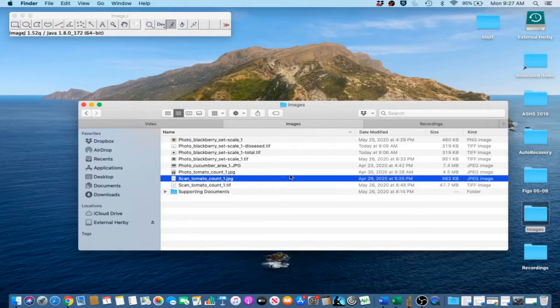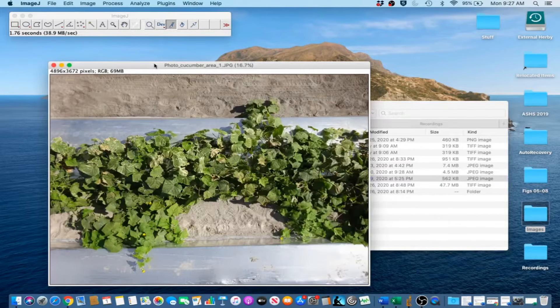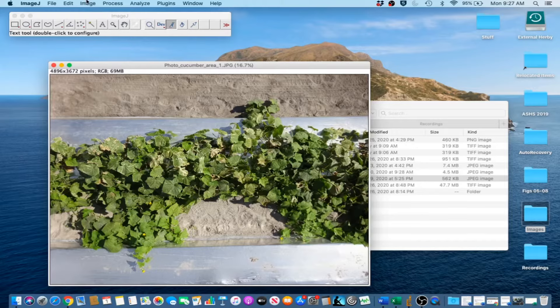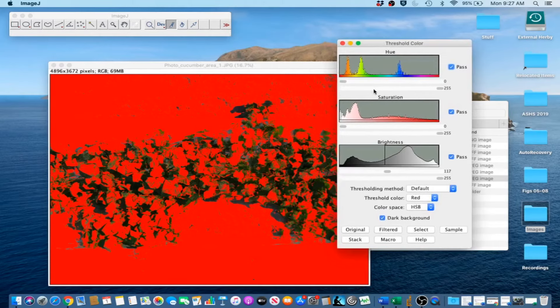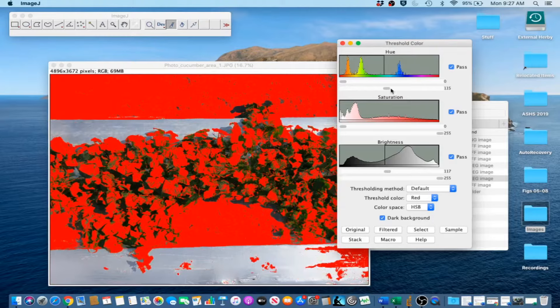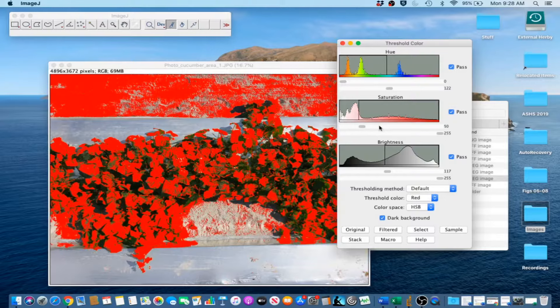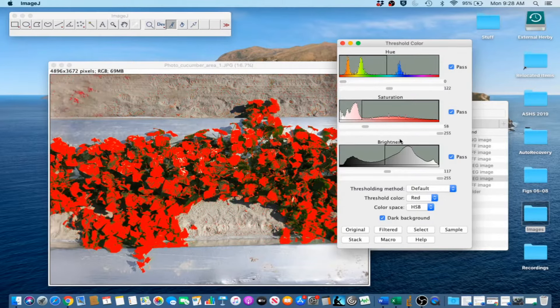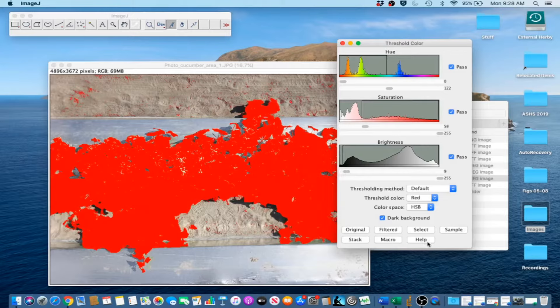We just captured the percentage of disease damage for a few sample leaves. But what about capturing it for multiple plants? This is a photograph of cucumber plants on metalized plastic mulch taken with a Sony DSC-RX100 compact digital camera. They have downy mildew and the damage is displayed as necrosis on the vines. Go to Image, Adjust, Color Threshold to separate the canopy from the background. Set hue between 0 and 122, saturation between 58 and 255, and brightness between 9 and 255. Click Select when you are satisfied.